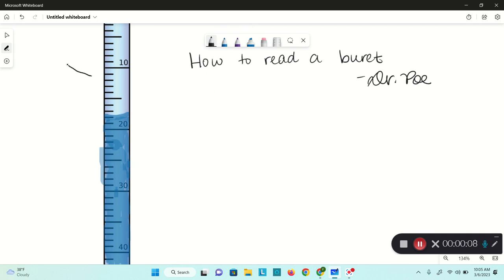I've got my burette over here on the left, and this is what we use for titrations. For our burette, we have different indicator markings. Because we're measuring volume, these are likely going to be in milliliters, unless you're told otherwise. Some of them are always going to be labeled. For example, on this burette, we've got the 10 milliliter line right here, the 20 milliliter line right there, 30 milliliter line, and so on.